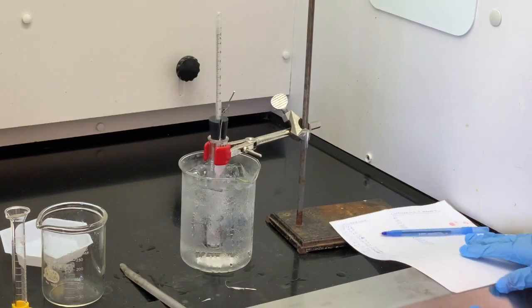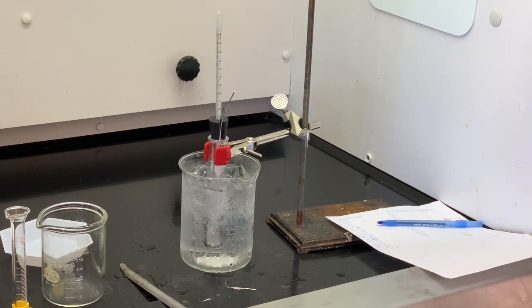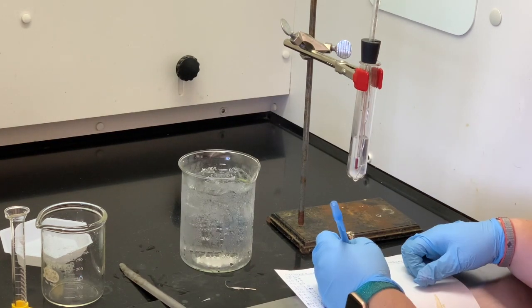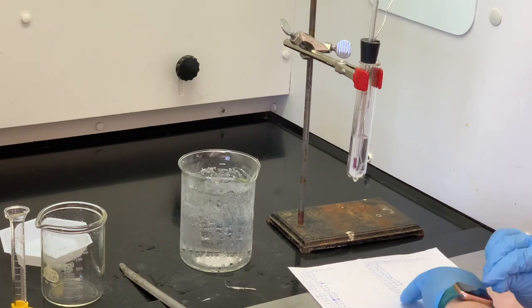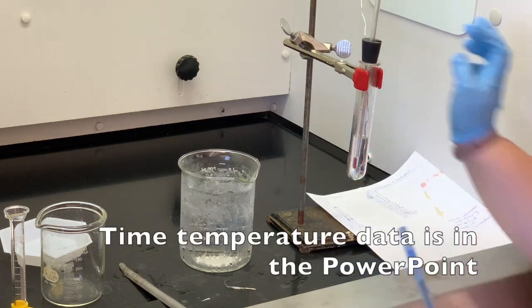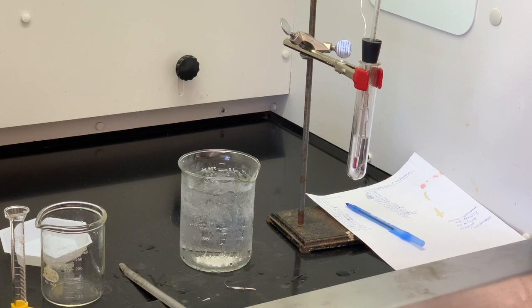Our solution is frozen now, so I'm going to take it up out of the ice bath and monitor the temperature every 30 seconds until we've reached about 10 to 12 degrees. Our temperature is now about 11 degrees Celsius, so I'm going to stop taking the temperature. You do have enough data to plot and find your experimental freezing point of the solution. You're going to use that freezing point of your solution for calculating the molar mass of your unknown.